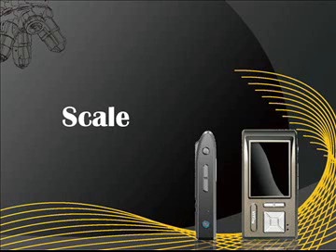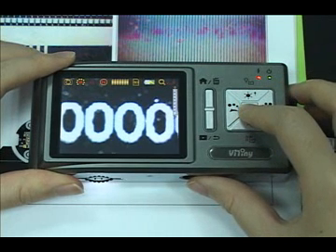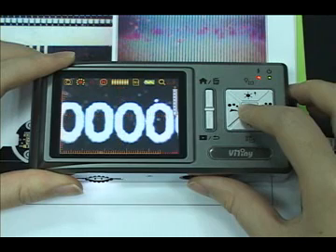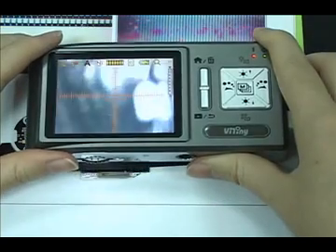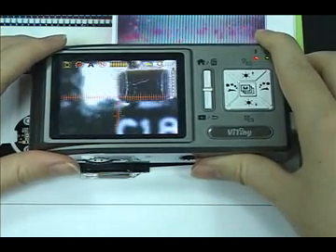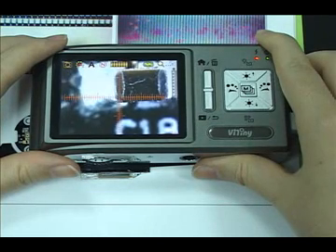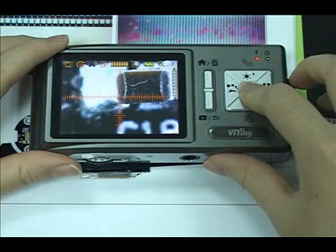Scale: press and hold the middle button to display the scale. While holding the middle button, select different scales — L shape scale and crossing scale. After selection, release the button. Press it again to hide the scale.